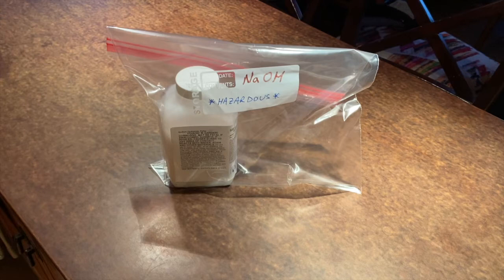Which brings up another very important step, which is to inform others in your household potentially impacted by a hazardous substance about the presence and nature of that hazard, so they're aware and complicit in ensuring safety. In my case, I have kept the dry hydroxide in its original labeled container with all its danger warnings, and labeled the secondary containment as well. I've also informed others who commonly use this space what's going on.